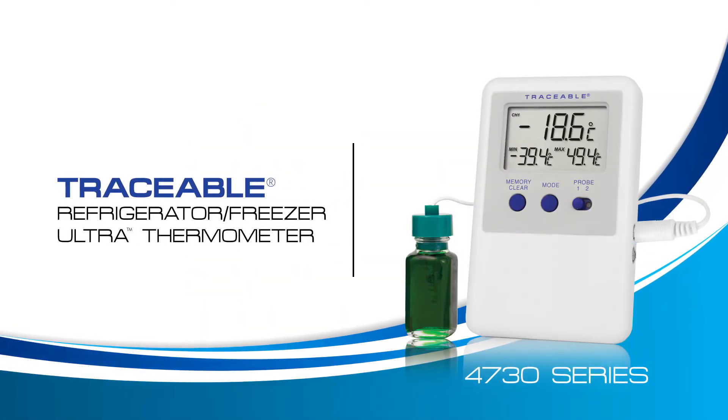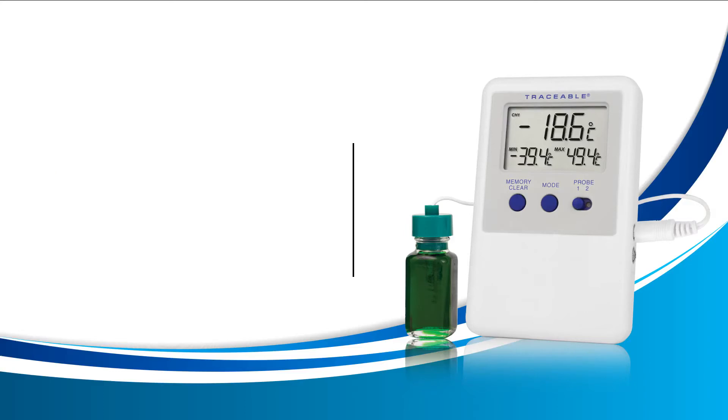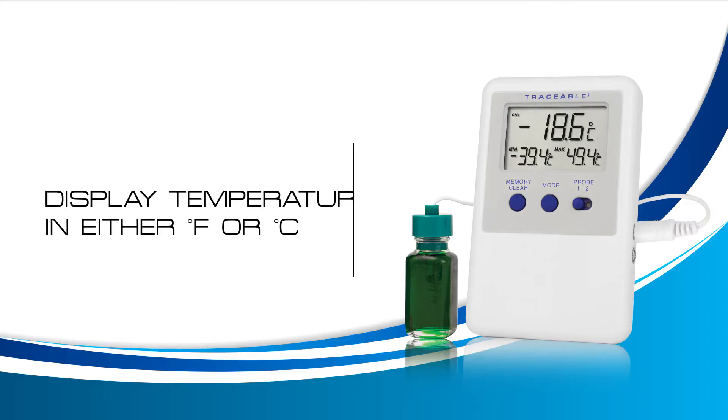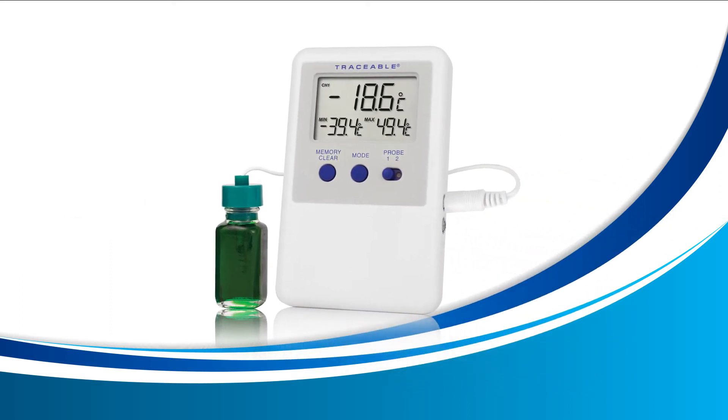Welcome to a Traceable Products instructional video for the Traceable Refrigerator Freezer Ultra Thermometer. In this video, we're going to learn how to display our temperature readings in either Fahrenheit or Celsius. This can be done at any time and the change takes effect right away.